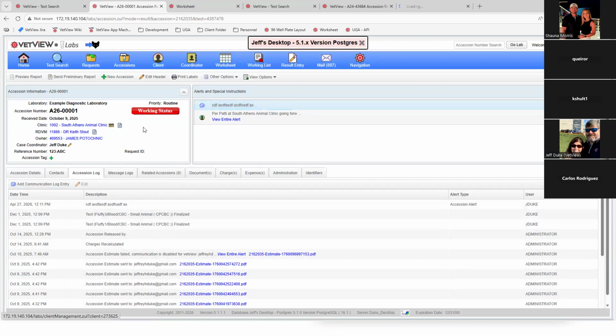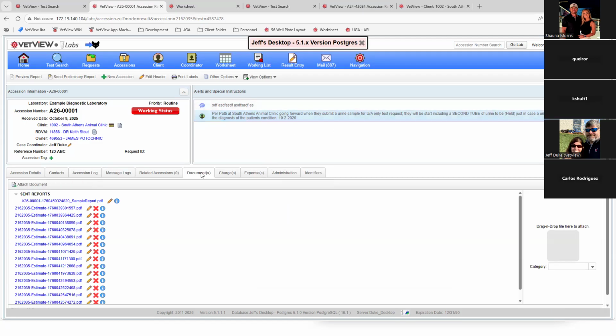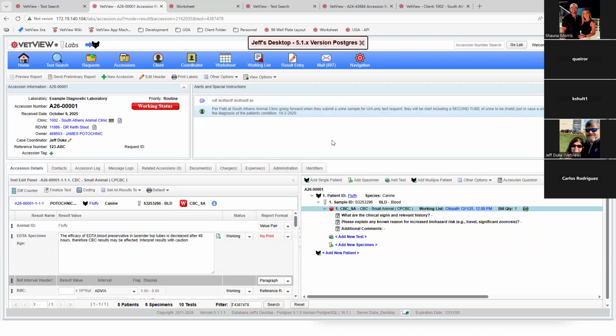Clients can also have comments. You can see this client has a comment on their client record. So you can add comments, or comments and alerts, to sessions or clients to track that information, hopefully alert or notify people of things, or record conversations you had with clients around a case. And in combination with that, you also have your document tab where you can attach anything you want.